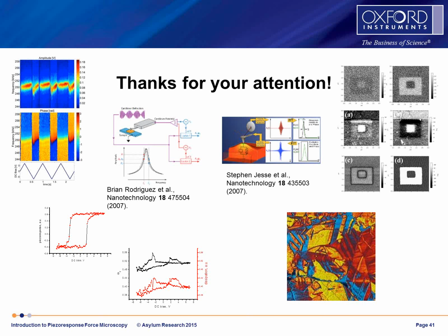There is not much we can do about it other than go to very low temperature measurements. The second type of noise is the 1/f noise, which appears in electronics and in some sense limits how much information we can get in PFM if we simply increase the image accumulation times. This one is also something that we cannot do much about, and it's just there. The only way to deal with it is to go to better electronics.